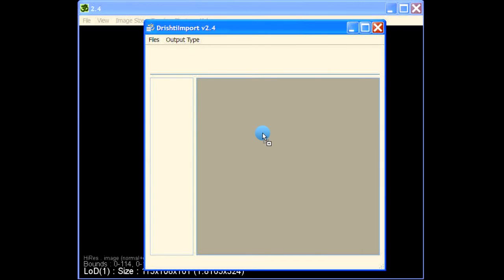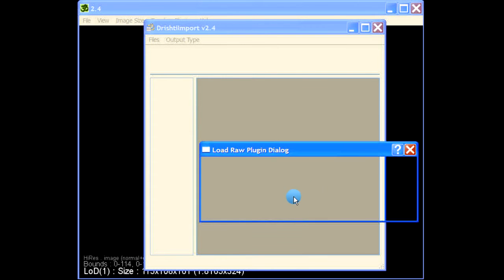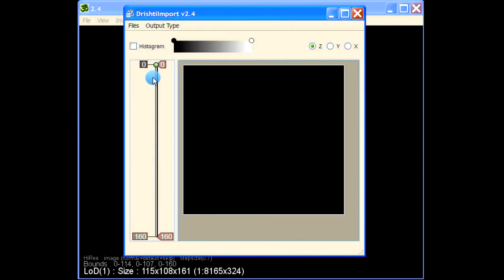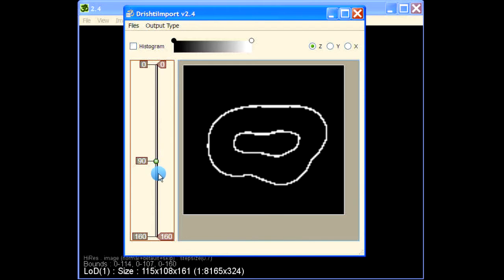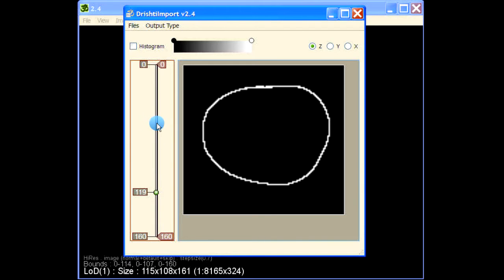here. So I'm dragging t18.pvl.nc.001, which is a raw file, and now you can see that this border is a bit thicker compared to T6.